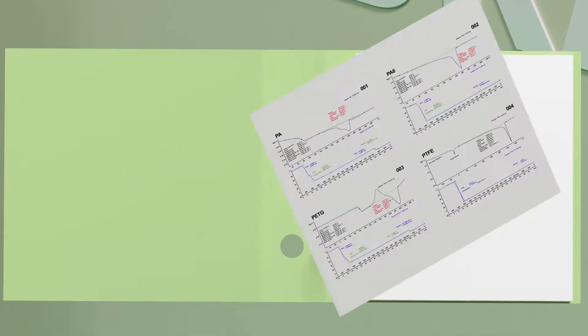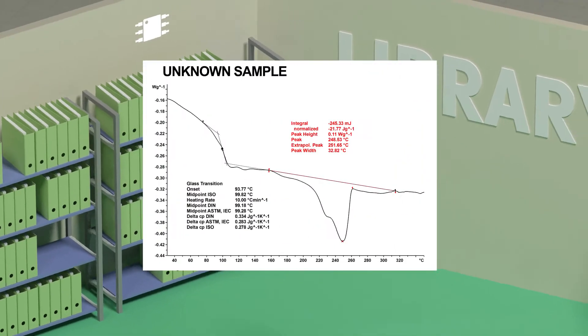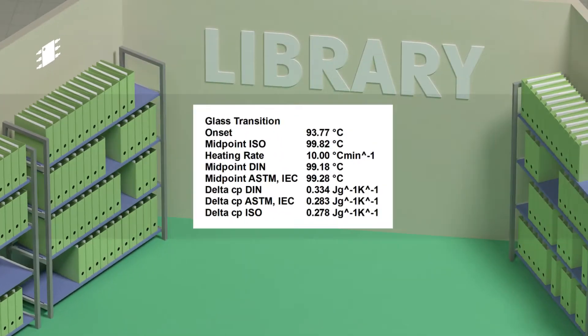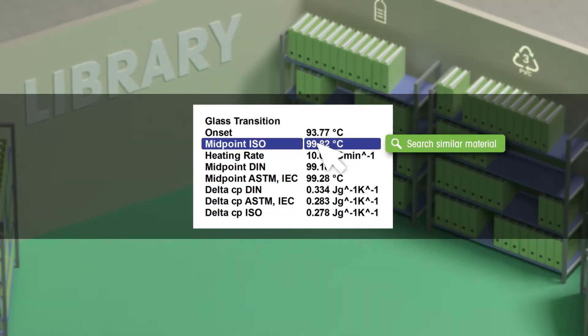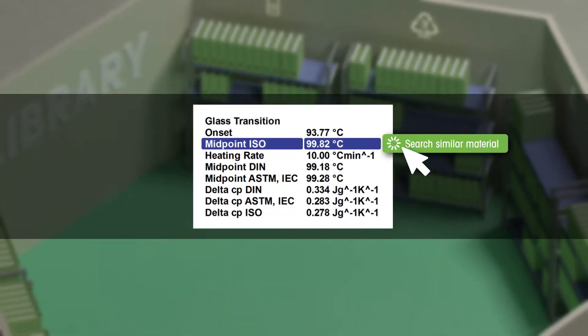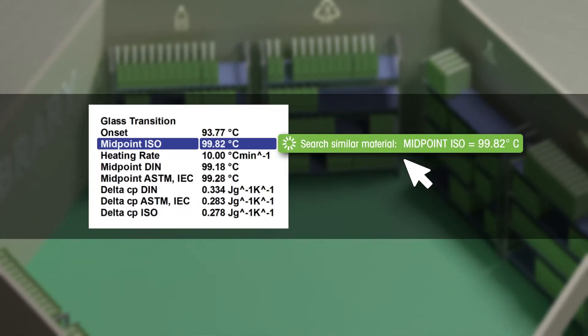There are no limits. Then you can search the reference library for materials with similar properties to verify your interpretation.